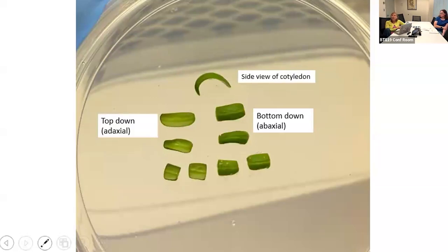When I've talked with people and they say, oh, I've got a lot of overgrowth, we've learned that they didn't measure that OD and it was way off. And so they were infecting with a lot more Agrobacterium than they needed. And I think for some species, tomato, of the species we work with, and you can correct me if I'm wrong, if we get any overgrowth, it seems to be more with tomato than other systems. And so if people are using an Agrobacterium concentration that's way over the 0.6, then it's not just about transformation efficiency, it's about controlling that overgrowth.